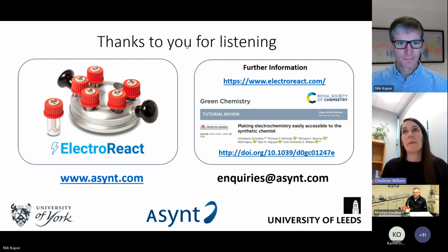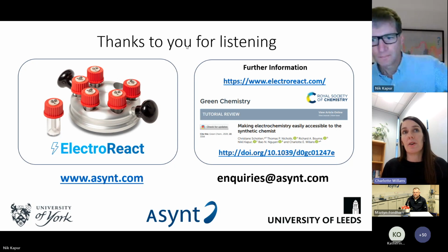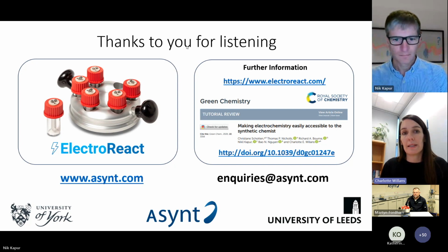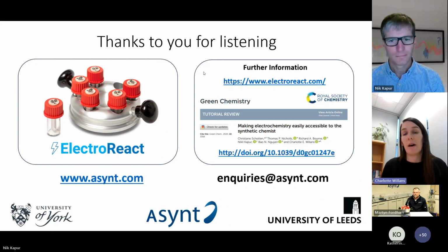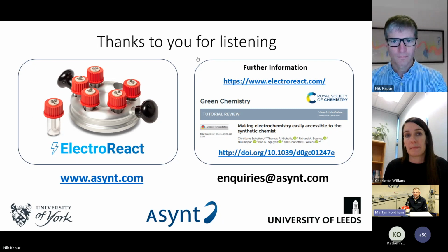What I would say is the highest risk of doing electrosynthesis is if the electrodes were to touch each other, and then, of course, you're in a flammable solvent. But the really nice thing is that the electrodes are held very firmly and securely. They're at a fixed distance apart, so there's no risk of them touching each other. So that limits the risk there.